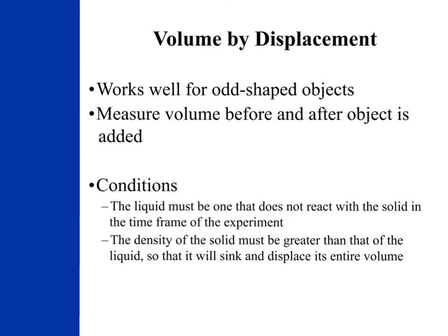There are a couple of conditions you have to be concerned about when measuring the volume by displacement, because these things can happen. First, the liquid must not be one that will react with a solid in the time frame of the experiment. So if something will have a very slow reaction over a number of days, it will be okay to measure in it, because your solid's only going to be in there for a few seconds.